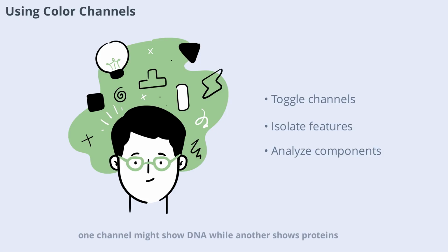For example, one channel might show DNA while another shows proteins. By toggling these channels on and off, you can isolate and analyze individual features more effectively.